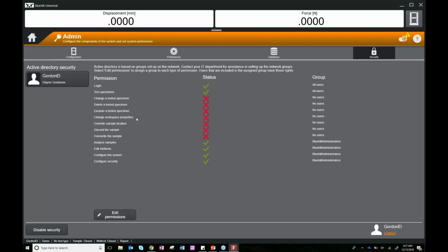And you can now, okay, this is what I have the ability to do. These were set to all users. These were set to the Bluehill administrators group. I'm in the Bluehill administrators group, so I'm here. And I have the ability to do these two top things. And although I'm an administrator, I don't have the ability to do any of this. So no users can do that. And you can see that I'm logged in as the administrator.